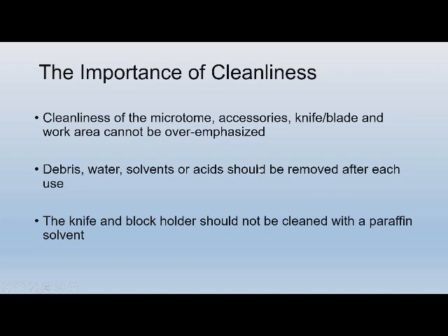So the importance of cleanliness with our knives and our microtomes cannot be overemphasized. We want to get all the debris off of it, the acids. If you decalcify at your microtome, or you use ammonia water to soak, say, really dry bone marrow clots or something, blood, something like that, then you want to clean all of that off of your knife holder, because if you don't, you're going to end up with a very rusted knife holder.